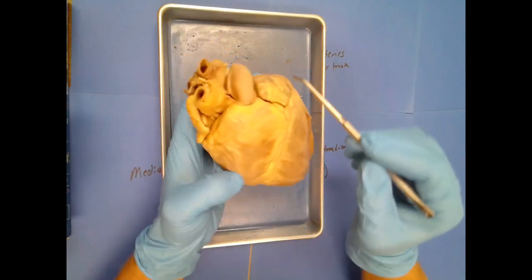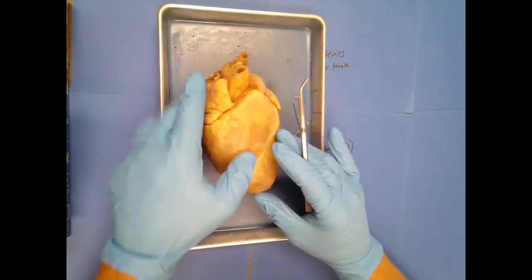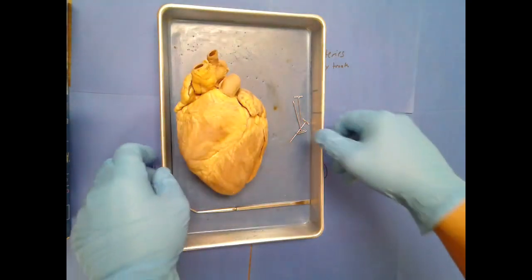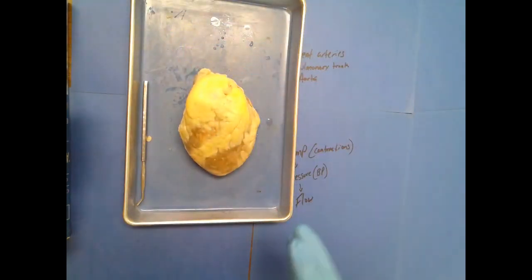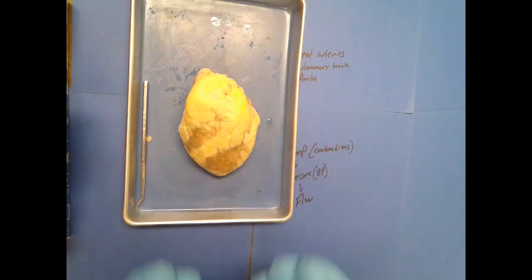Okay, now I'm going to move next to some sheep hearts that I actually used for my class. I've got three different ones that I had cut open that we're going to take a look at. Because I'm in a pinch for time on this, I didn't cut the fat off because normally hearts have some adipose tissue around the outsides of them, which plays an integral role in energy and cushioning of the heart.